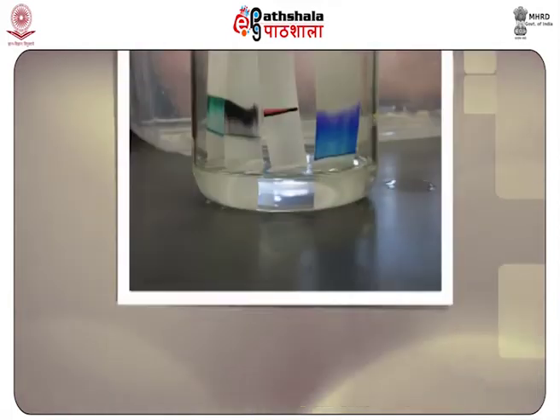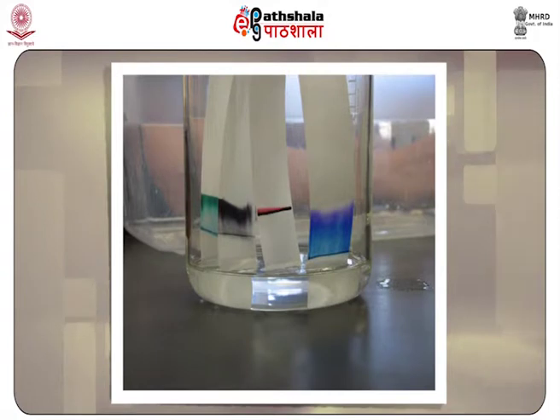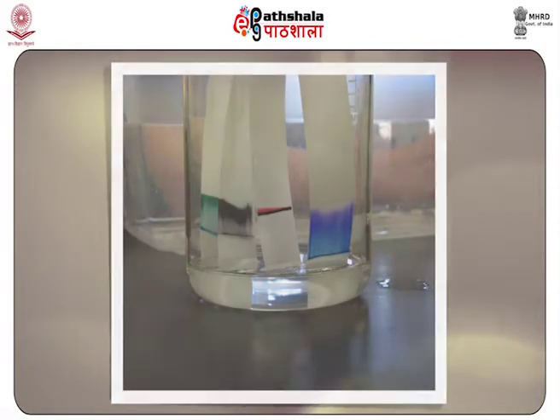The different components of the sample get separated based on their relative affinity towards the stationary phase versus their relative solubility in the mobile phase.